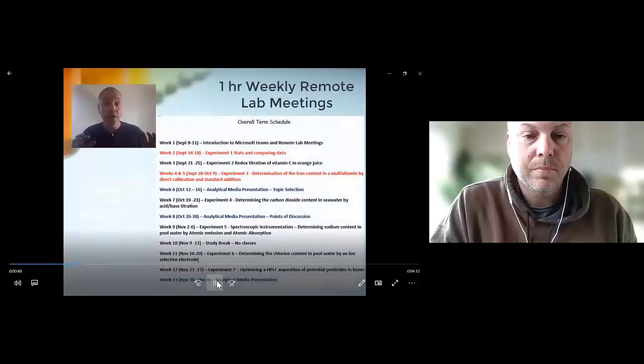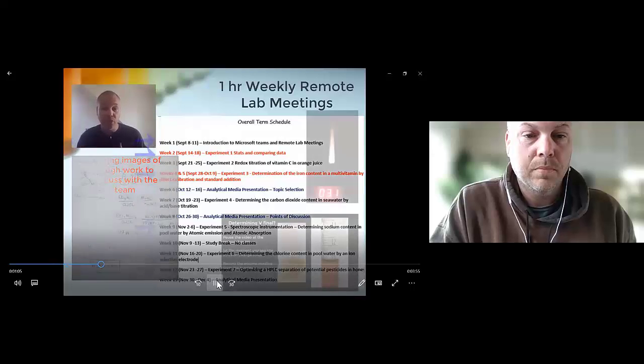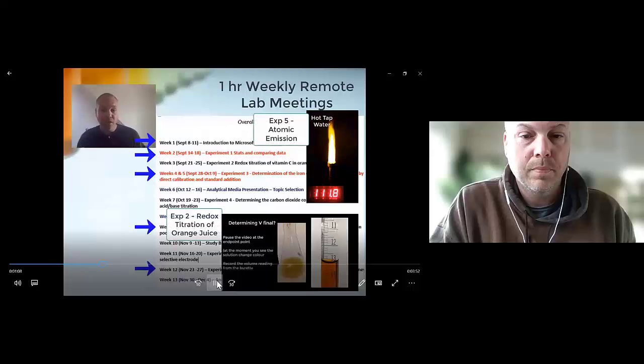As such, we developed a very intense schedule for our 13-week term for our introductory analytical chemistry students. 12 of those weeks involved the students meeting in small groups, 3 to 5, with a TA. In these small remote lab meetings, as I called them, the students would share and discuss their work for pre-lab questions with each other. Also, I'd like to point out 6 of the weeks during the term, students collected data and did experiments at home without any kits being sent out.